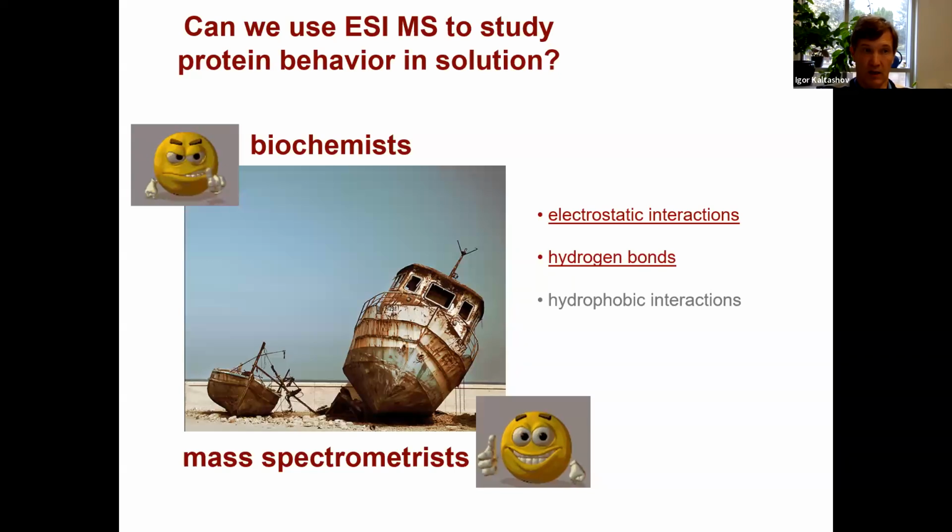So hydrogen bonds are distinct from electrostatic interactions. And then, of course, there are hydrophobic interactions. Fortunately, when you pull a biopolymer from its native environment into the gas phase, you are not really doing anything bad as far as electrostatic interactions or hydrogen bonds. In fact, hydrogen bonds would become stronger because now there is no solvent.